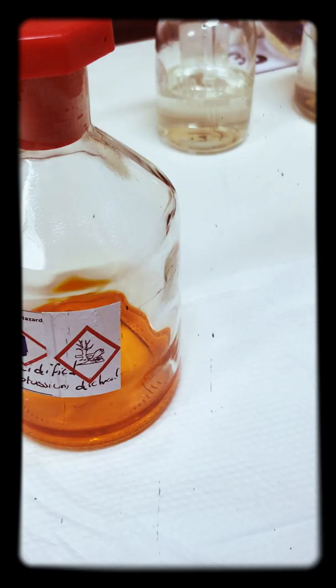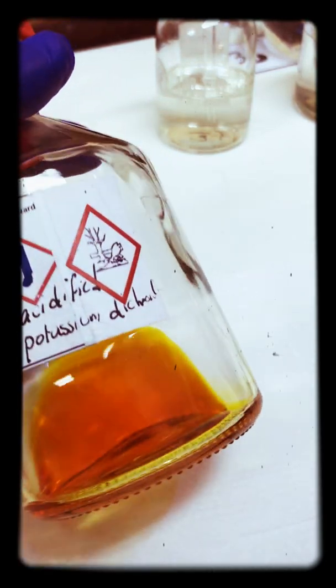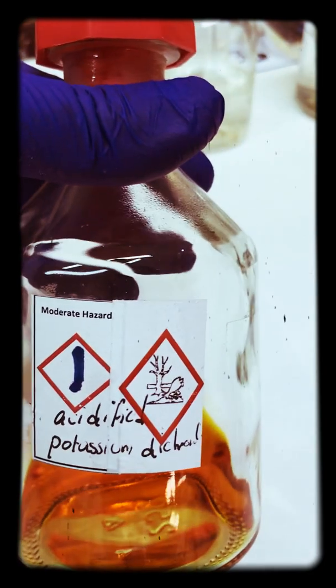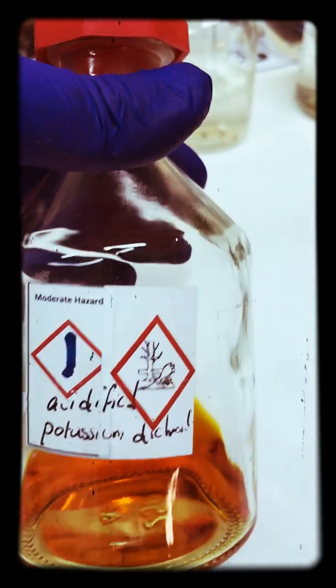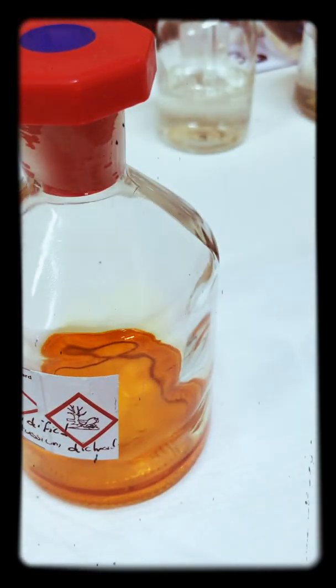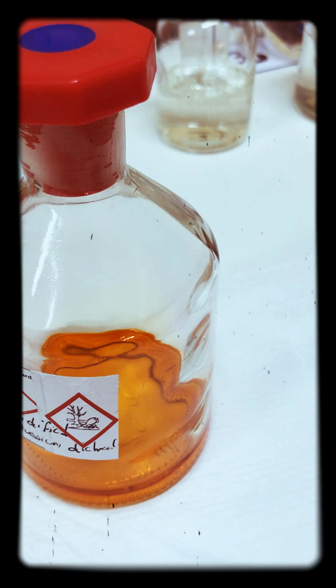Hi folks, this is to demonstrate the oxidizing agent properties of acidified potassium dichromate. Dichromate as an ion is Cr2O7 2- with an overall two minus charge. That means the chromium inside the dichromate has an oxidation state of plus six.